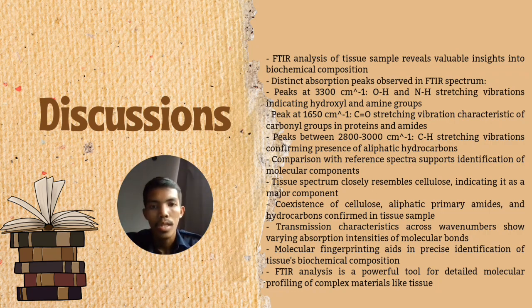Peak at 1,650 cm^-1, C=O stretching vibration, is characteristic of carbonyl groups in proteins and amides. Peaks between 2,800 and 3,000 cm^-1 are carbon and hydrogen stretching vibrations, confirming the presence of aliphatic hydrocarbons.